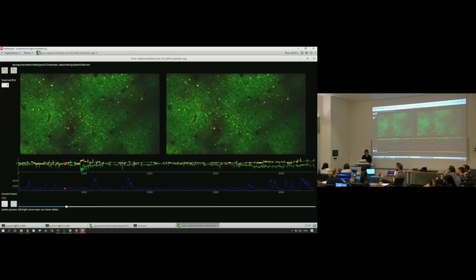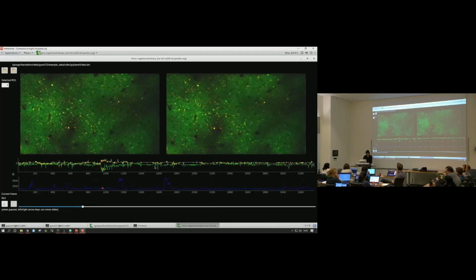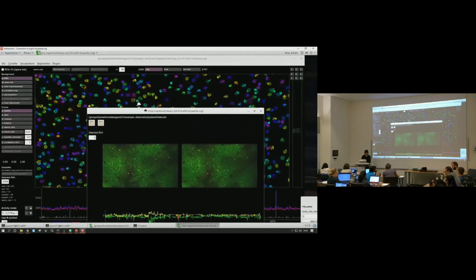Yeah, you don't want to take ROIs there, definitely, because we could fill it in with anything, right? We could fill it in with zeros. It doesn't really matter. But you really don't want to take ROIs on places where shifts are often happening. So in this case, shifts are pretty small. I don't know why I don't have a scale bar here, but they're on the order of 5 to 10 pixels or less. But anything more than that, I don't want to crop any less than that, because then I'll get crap, basically. And you'll be able to tell if you have ROIs that are just living on the edges. There might be some even in this recording.